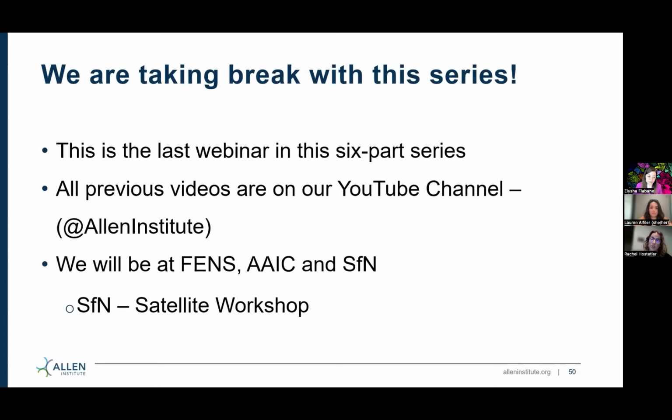I've been to the Vizgen website if you're using that version to look at how they do their cell segmentation. But as of right now, for the one that we have for the Allen Institute, I'll have to check if it's on our GitHub, because we do have a lot of information on our GitHub. But I do not believe the cell segmentation is currently on our GitHub, because that's still in the works or being improved. I would check the Vizgen website, which I know has support resources if that's the platform you're using for your MERFISH segmentation.